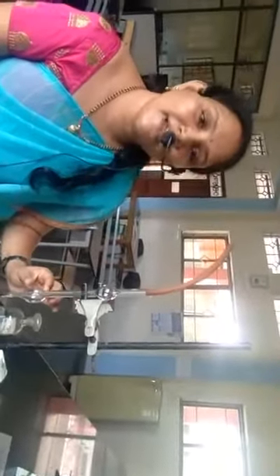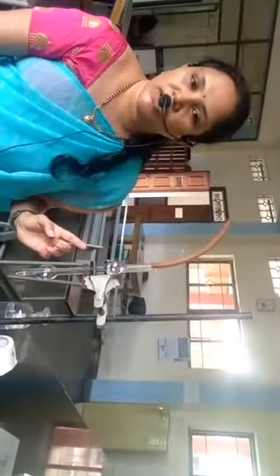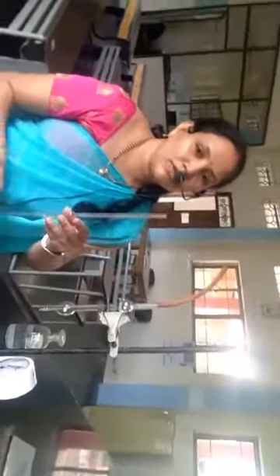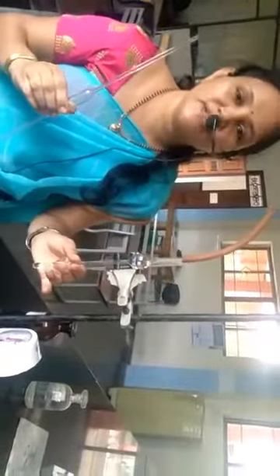The first part is we shall be using a viscometer, and in this viscometer we will be taking a specified volume of the organic liquid first and then of water. First I will be using a pipette to pipette out the organic liquid. Now I have taken 10 ml of organic liquid in a dry pipette and transferred it to the broader limb of the viscometer. Now there is 10 ml in this bulb.